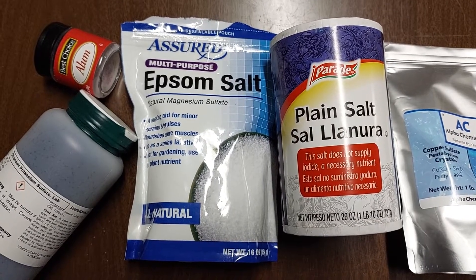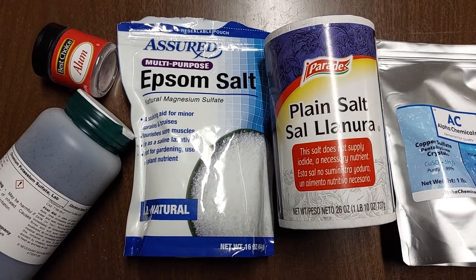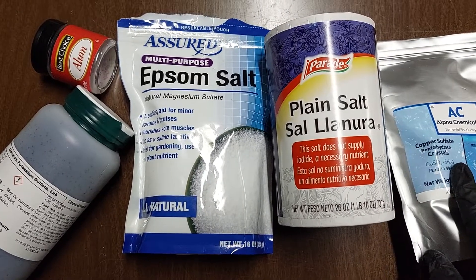Step one for making your crystals: pick a salt you want and dissolve it in water. You can use copper sulfate — that's the blue crystals.